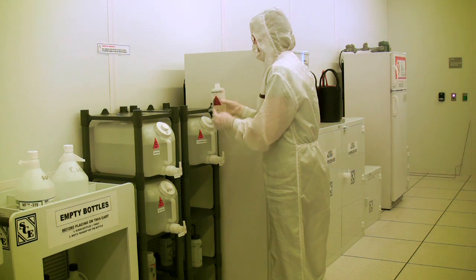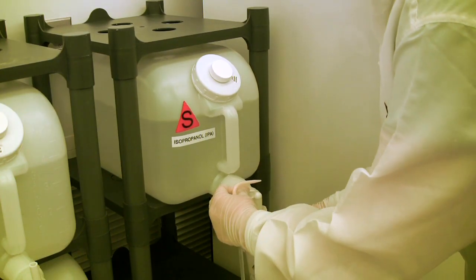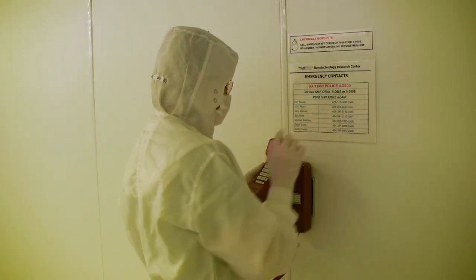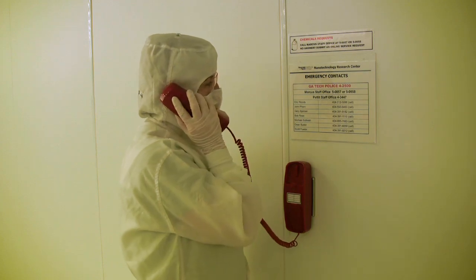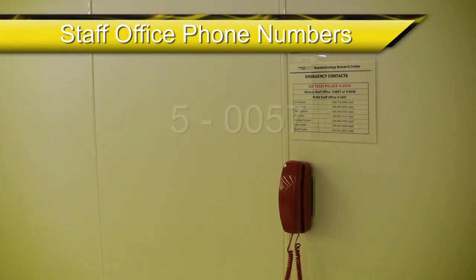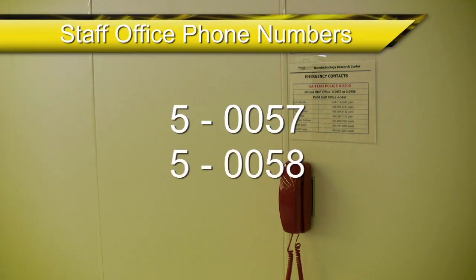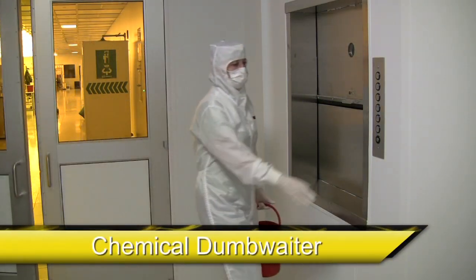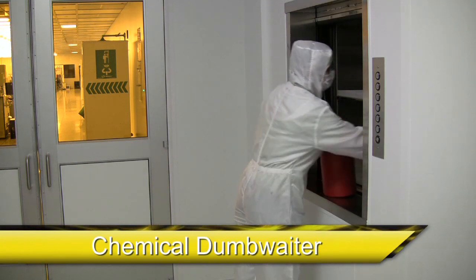The general use solvent bottles can be refilled in the supply storage area as well. If a particular chemical cannot be found there, you may need to call the cleanroom staff — the phone numbers for the cleanroom staff offices are 50057 and 50058. When you request a chemical to be delivered to the cleanroom, it will be done via the chemical dumbwaiter, which is located in the cleanroom wipe down area.